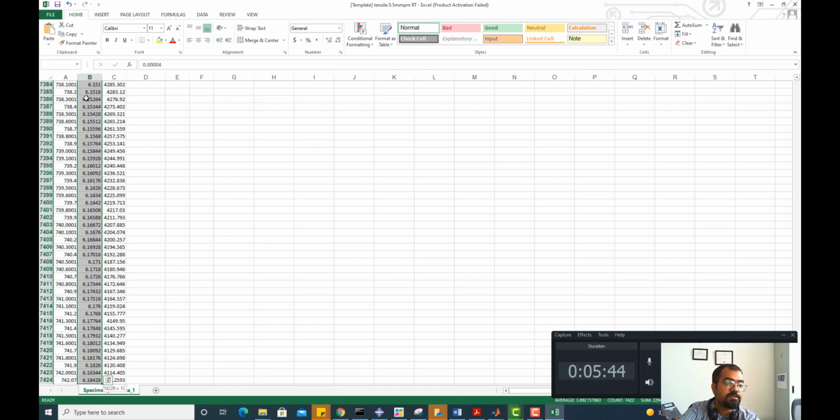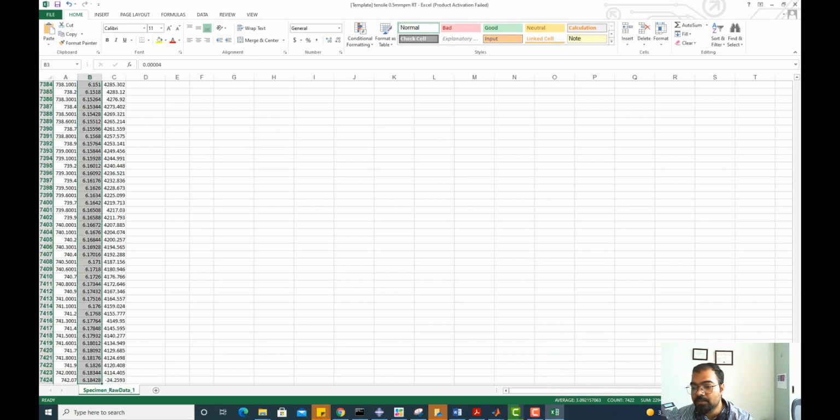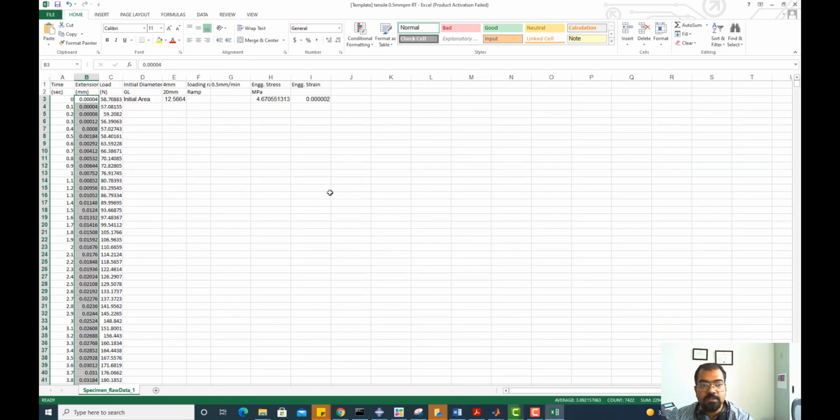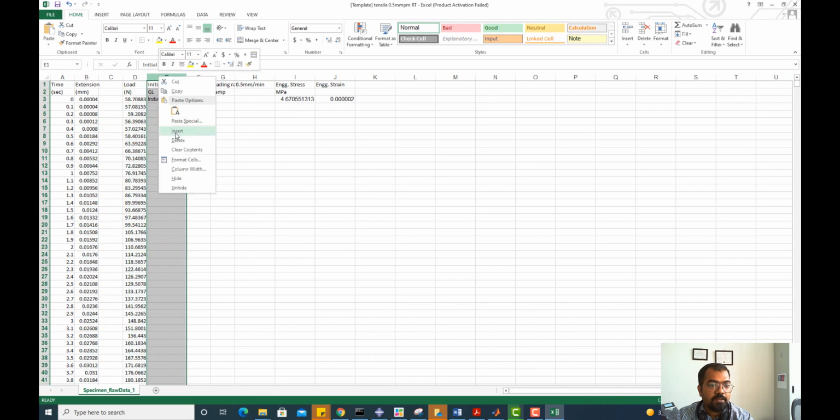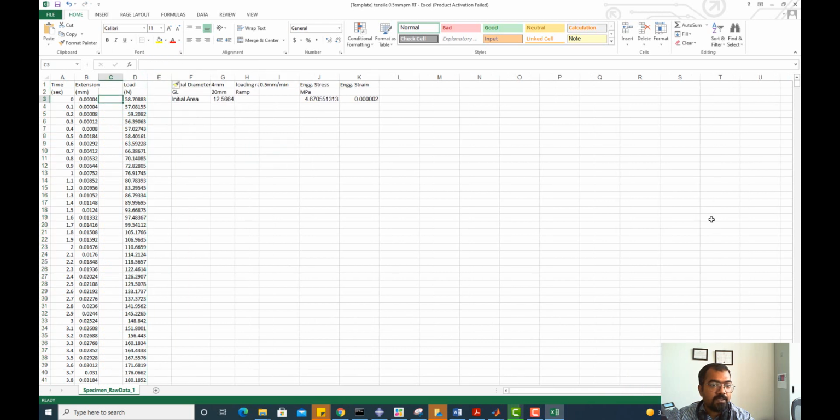I think it is 7,500 points. That is not too much, but sometimes you can have huge data, depending on the frequency at which the machine is recording. So you can have different ways of smoothing the data. I will use a very lazy way of doing it.